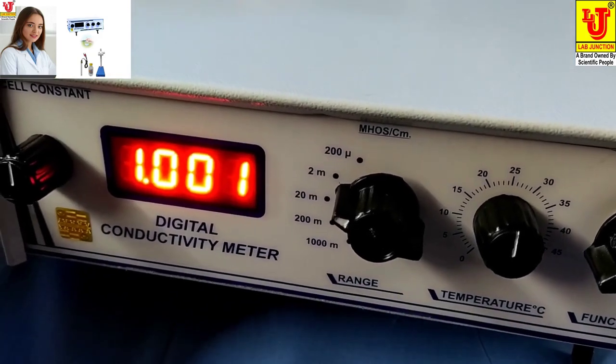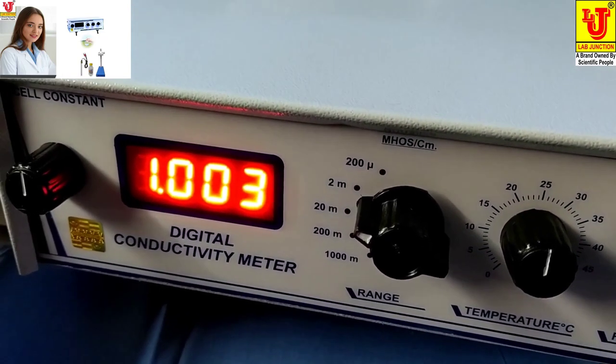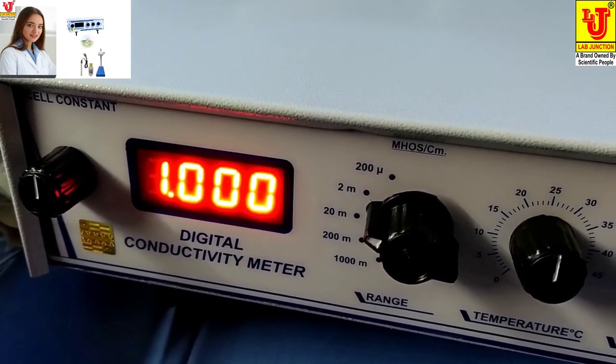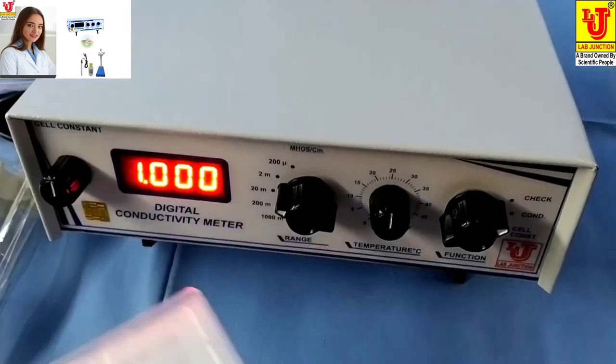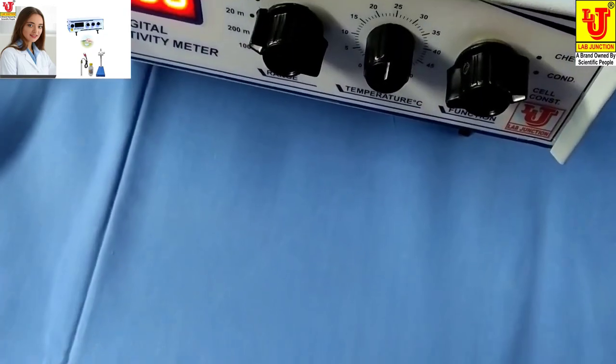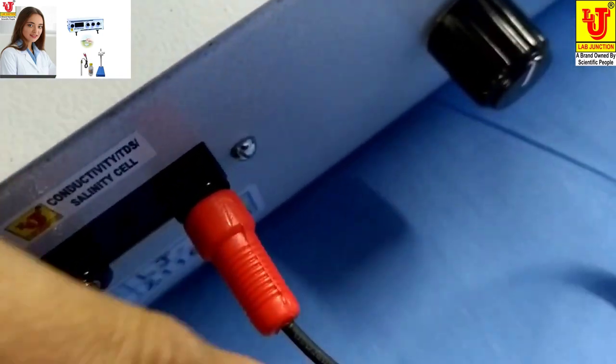Suppose this is blinking, again you can set that there. Now I am connecting Conductivity Cell to our Digital Conductivity Meter like this way.